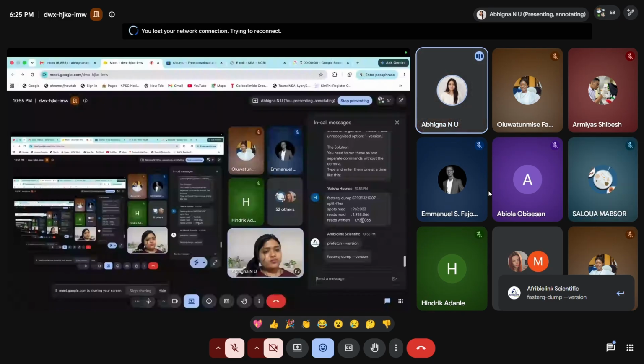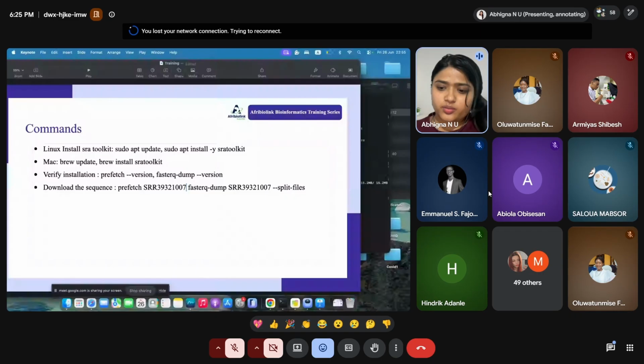I think I'll remove the comma from the PPT as well, if people are getting confused.